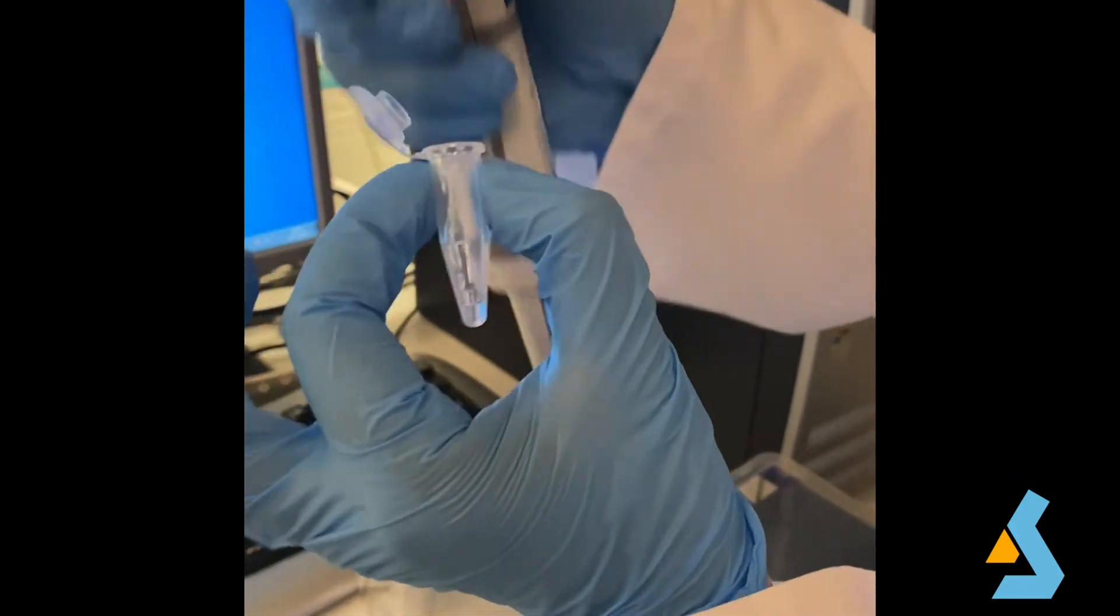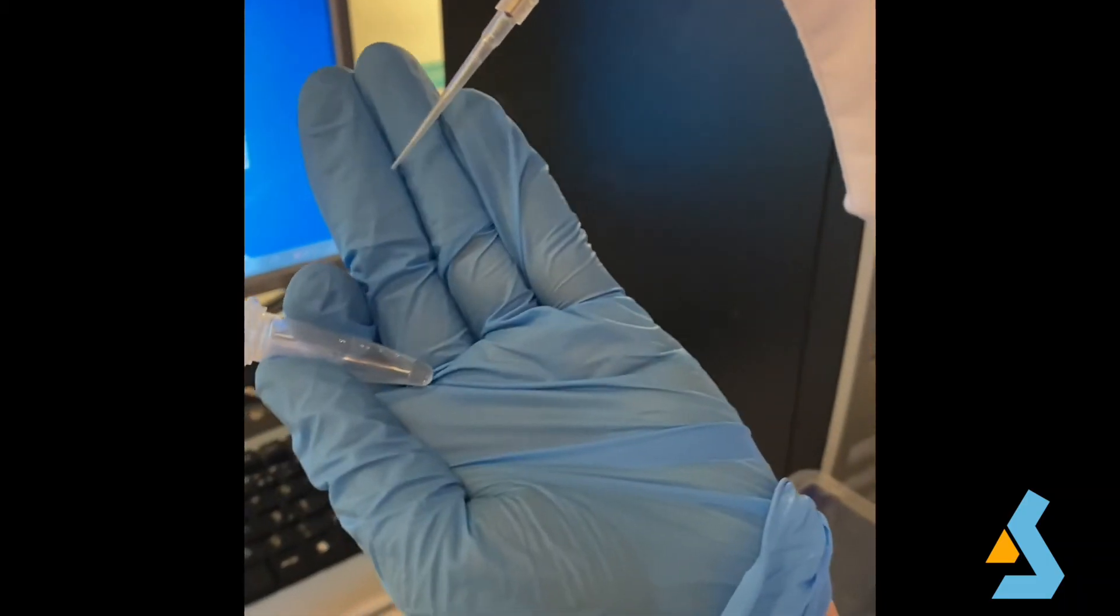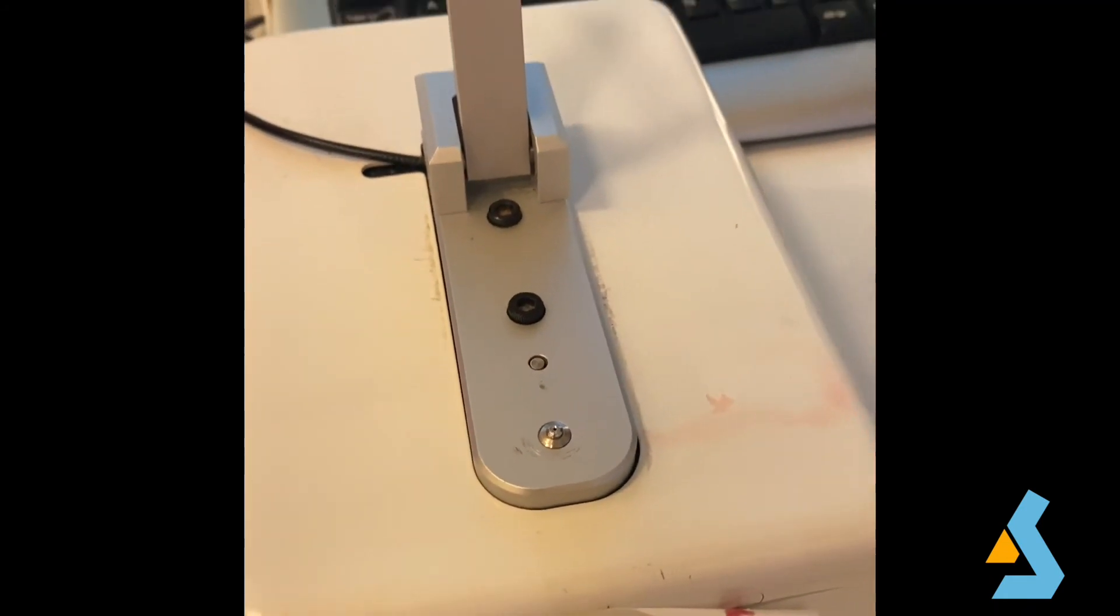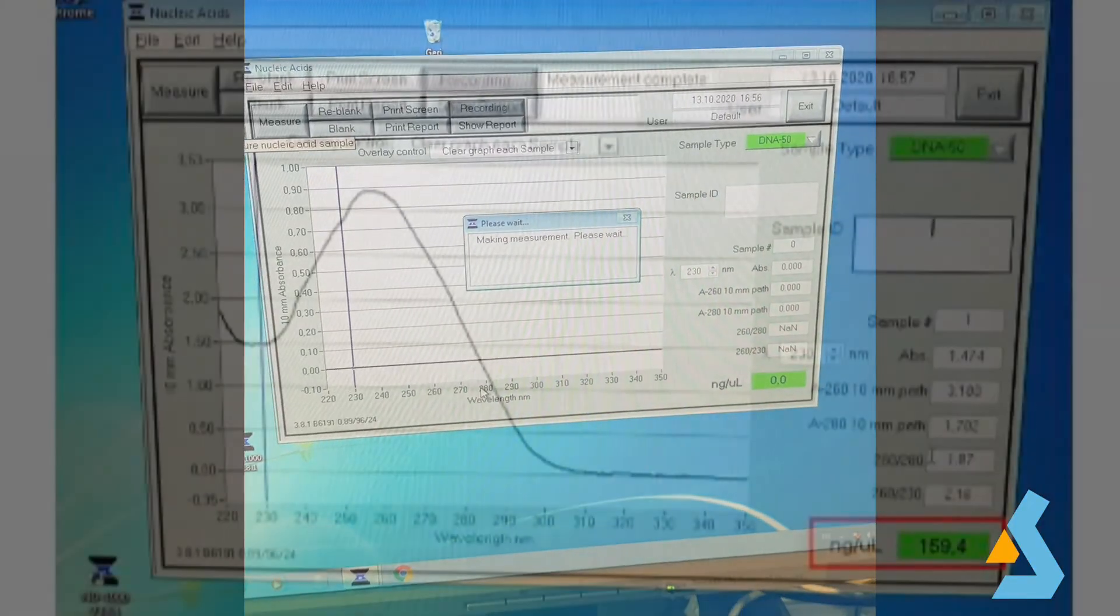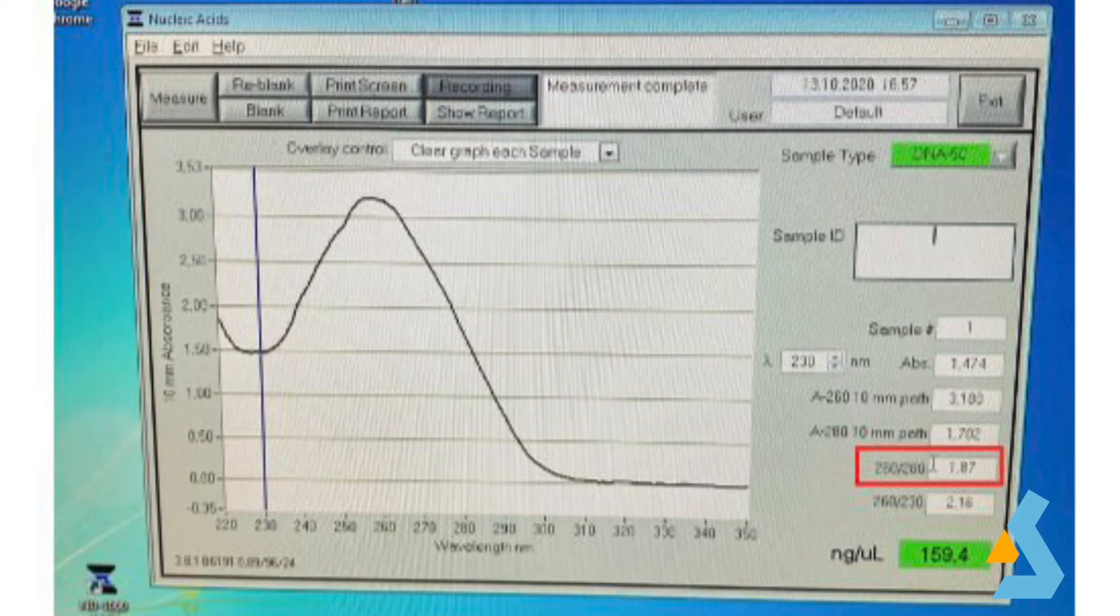After taking a blank, we can start measuring our sample. Just as for blank, we should take 1 microliter of the sample and put it onto the lower pedestal. This time, we should click the measure part of the software. After measurement, the software will give us the concentration and also the purity parameters for our plasmid DNA. In this case, there are two values we need to pay attention. The first one is 260 to 280 ratio. The ratio is used to assess the purity of DNA and RNA. A ratio between 1.8 and 2 is generally accepted as pure for DNA or RNA. If the ratio is appreciably lower than expected, it can indicate the presence of protein, phenol, or other contaminants.